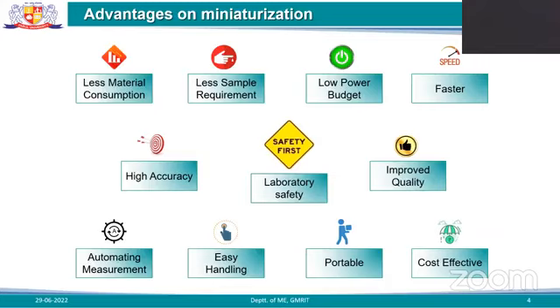But when we do the same thing with a pinch of blood, the requirement of the corresponding chemical will also be less. So it will give safety to the people who are working in the laboratory, and it will also give a much improved quality of the result.